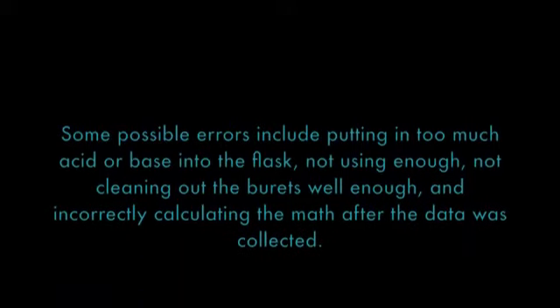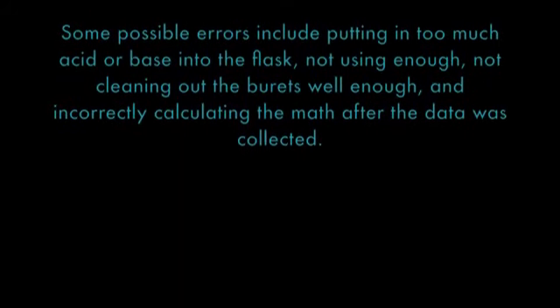Some possible errors include putting in too much acid or base into the flask, not using enough, not cleaning out the burettes well enough, and incorrectly calculating the math after the data was collected.